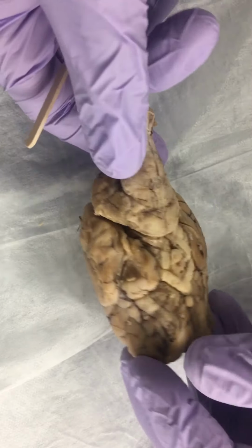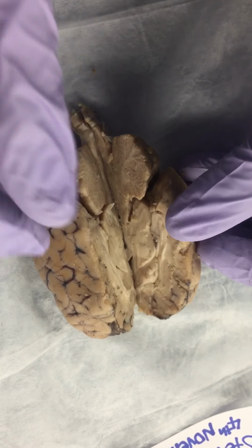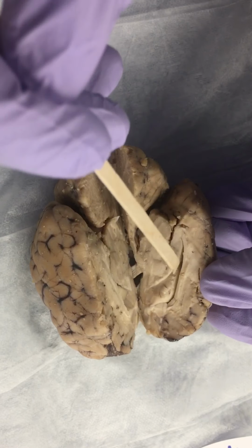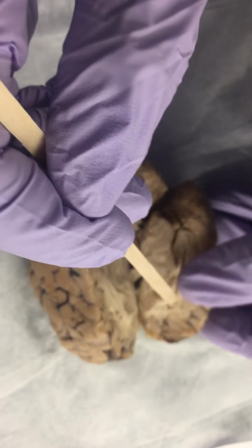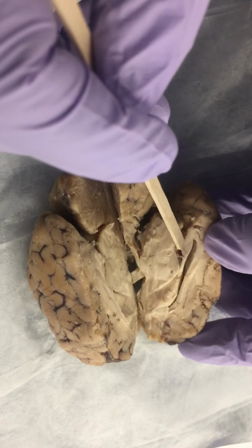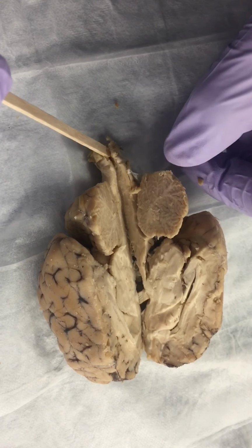And then we're going to flip it now, we're going to go inside the brain. As we cut open, we're going to open the brain. When you open the brain, you're going to have the frontal lobe right here, which is the very front, the occipital lobe in the back, and in here you have the corpus callosum. In there we have the thalamus, you have the fornix towards the end, you have the lateral ventricle right here, you have the third ventricle in here, and then at the bottom you have the fourth ventricle right behind the cerebellum, and it drains into the spinal cord.